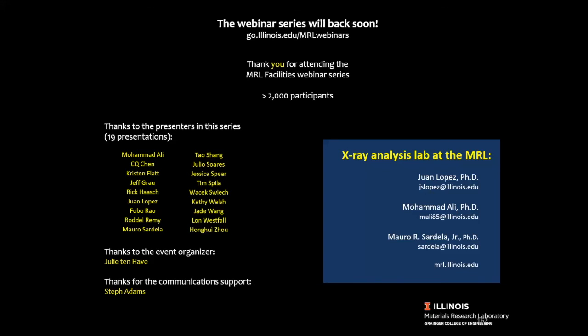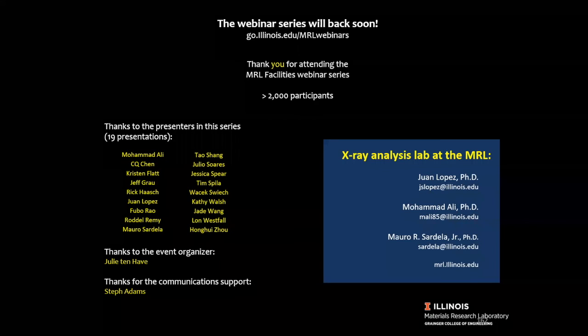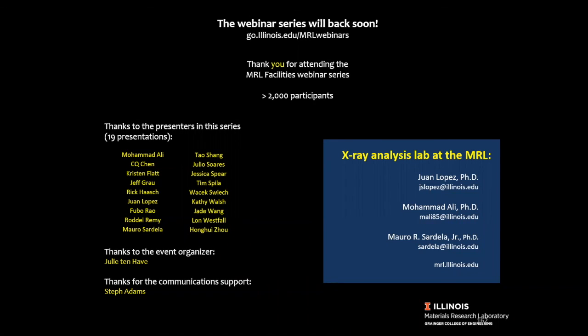I know that GSAS was a famous one, of course, a people's favorite. It has a bit of a steep learning curve. There is one in our lab. Juan, feel free to remind me what software you like. FullProf? FullProf, yeah. FullProf has the advantage of a very clean, nice interface and is free to download.